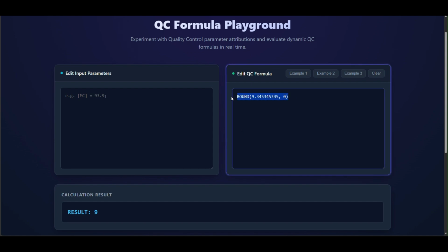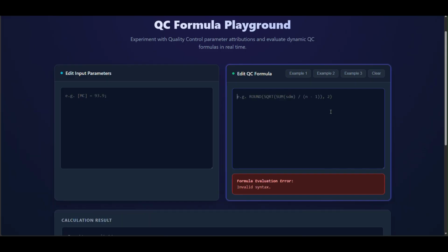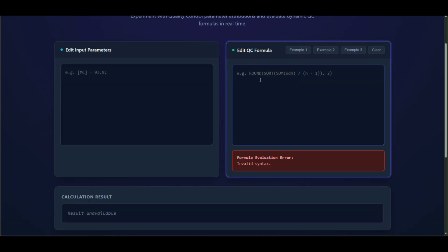Sometimes formulas are very complicated, and it's useful to be able to split a larger formula in smaller chunks, easier to read and to understand. In this way, it's easier to find mistakes. So we can use for this purpose local variables.